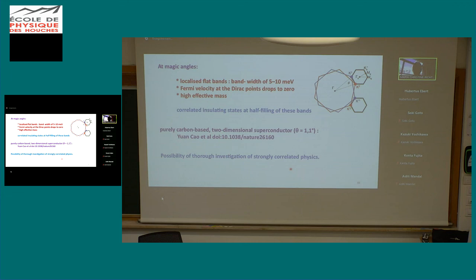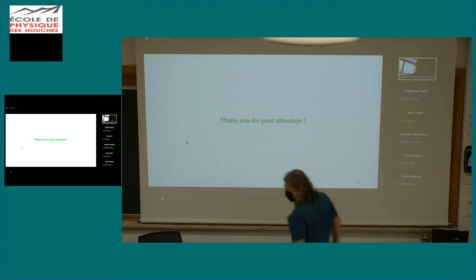As you know, for this first magic angle, superconductivity was measured quite recently on such a twisted bilayer graphene sample, so this is something worth getting into. For that we need a really small spot of light and to measure it with our analyzer. With this, I come to an end, because Laurent will leave 15 minutes for questions, and I thank you for your attention.